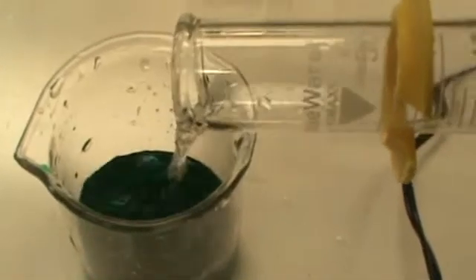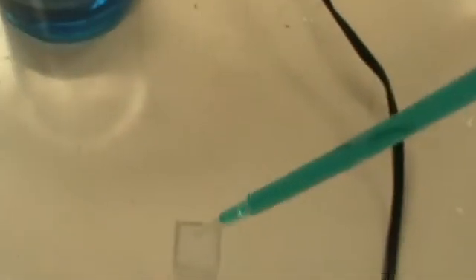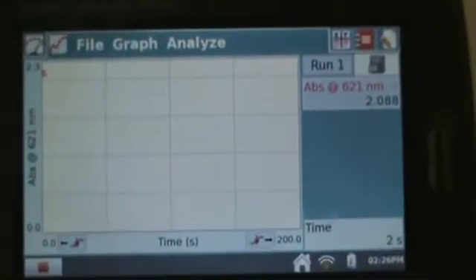Trial two — we have our green food coloring in water and I'm going to mix that with some bleach, then add it into a spectrophotometer and run. Here's our bleach, and as that adds you should see a change from green to blue as the green color really starts to fade quickly. We're going to take that, put it in here, and that is going to start tracking what our absorbance is over time.